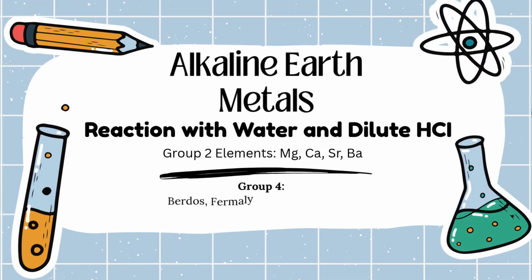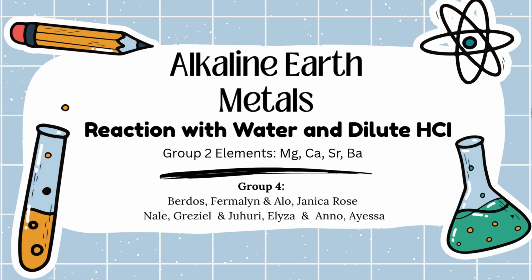Good day, everyone. So now let's proceed to the alkaline earth metals reaction with water and dilute hydrochloric acid. By the way, our topic for today is focusing on the group 2 elements in the periodic table, which is the magnesium, calcium, strontium, and barium.